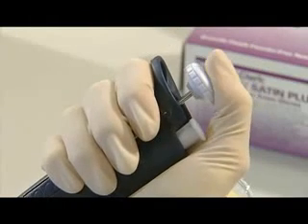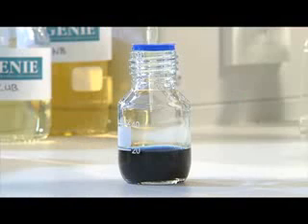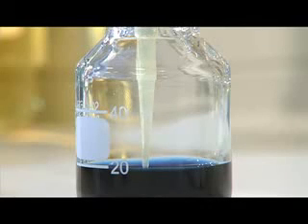So, to use the pipette, push the button down to the first stop. Then, keeping the push button at this level, place the pipette tip about 2mm into the liquid you wish to draw up.